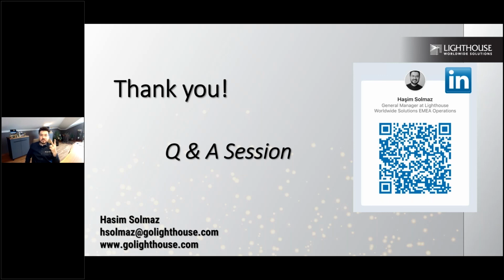The reason we take 2 samples is because we want to keep it parallel for pharmaceutical applications between GMP and ISO. We try to keep it parallel. That's why we take 0.5 and 5 micron respectively, because GMP requires both. There is a limit for both in GMP. But for ISO, one channel size is okay for classification. But we are recommending you to take 0.5, 1 and 5 micron together. You can use these 3 data, not for ISO, not for GMP, but for yourself, in order to see what's going on in your clean room. I think that's an important point.